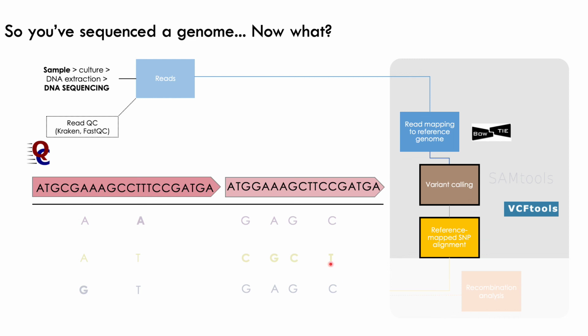And so what we do is we just take those polymorphic positions. We don't just take the SNPs themselves. We have to take the equivalent bases from all of the genomes. Otherwise, we end up with essentially a mess, just a lot of bases that don't necessarily go together. But when we know that we're pulling out the same position, then we're properly aligning them. So we take those nucleotides and we align them.